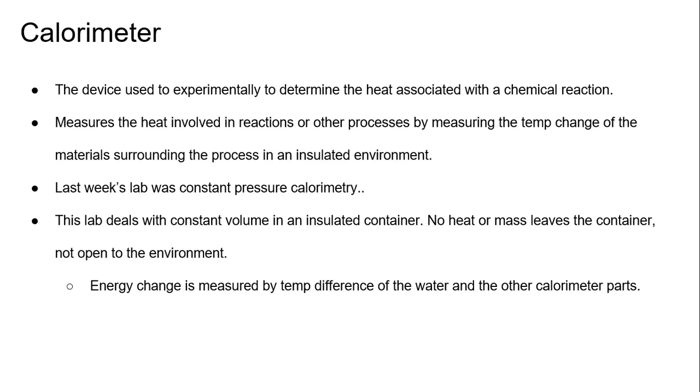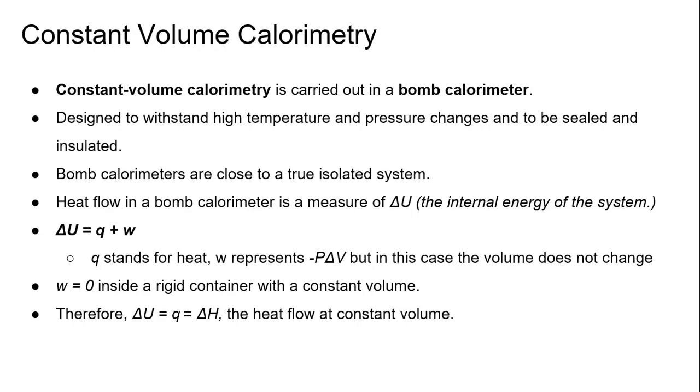Last week's lab was a constant pressure calorimetry, meaning it was open to the atmosphere, so the pressure inside the calorimeter and outside matched. In this case, it's completely insulated, so it is not open to the atmosphere, so the pressure will change, but it would be constant volume. No volume change would be occurring in this. Because it's insulated, no heat will come in or out, and mass will not leave. The energy change is measured by the temp difference of the water and of other calorimetry parts.